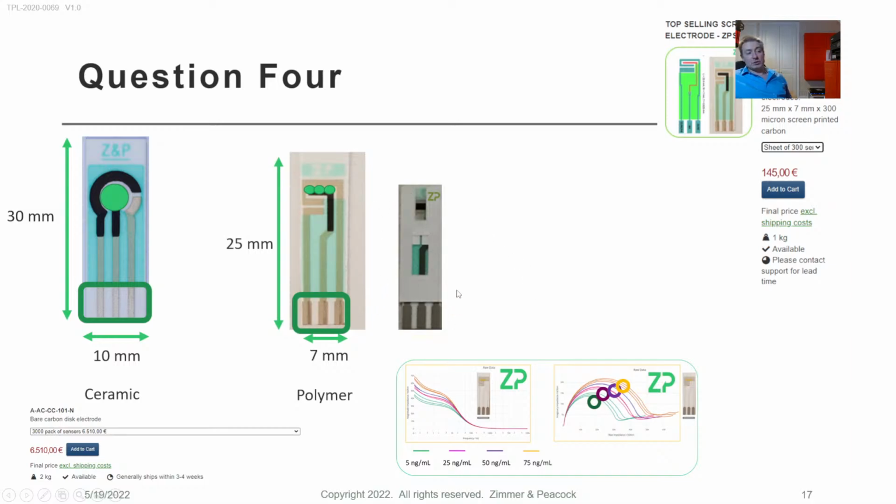This is one that we've converted in with microfluidics, and that's important now because I do think that people need to think about the microfluidics. If they're looking for an electrode, they're often going to have microfluidics associated with it. In this channel, the way the solution would run onto this, you would have a reference electrode, then the working, and then the counter. It means that the solution, as it flows on, essentially shorts the electrodes together, and that can be the signal to start the assay.